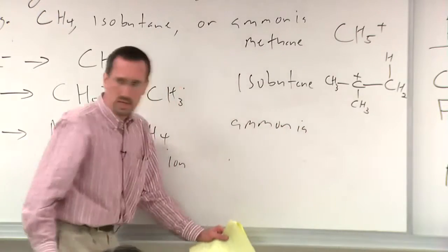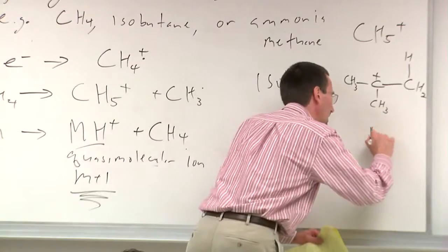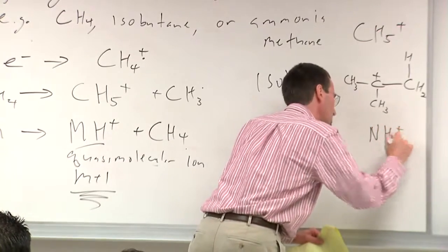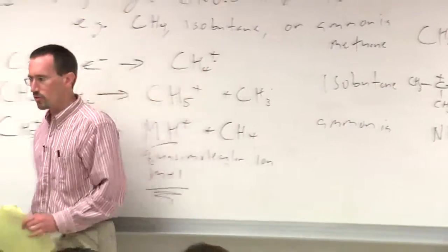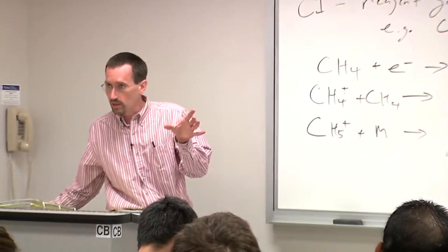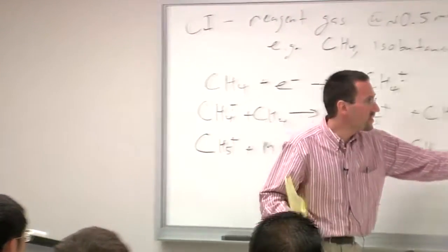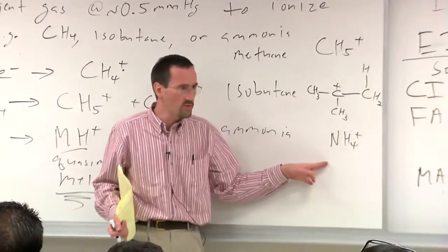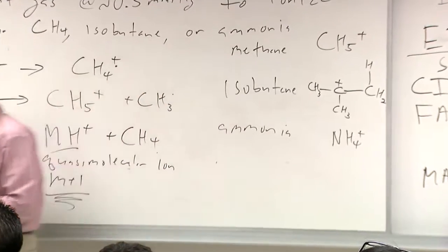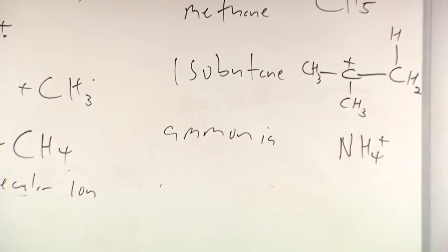although we don't usually think of the ammonium ion as being strongly acidic, in the gas phase, the ammonium ion is a strong acid because it gets its stability in water from being solvated. And here, you have no solvation. You don't have hydrogen bonding in the gas phase. So even the ammonium ion is a strong acid in the gas phase.